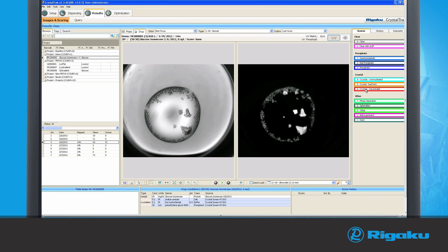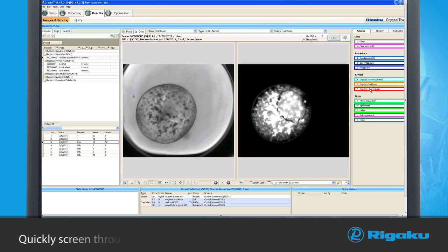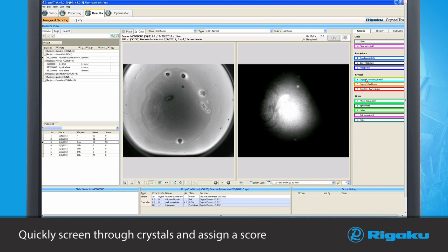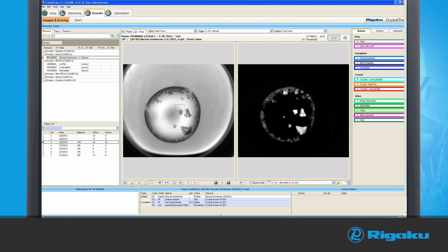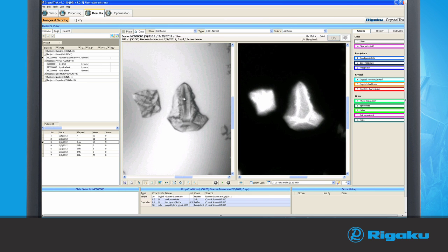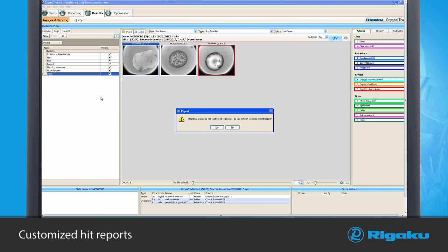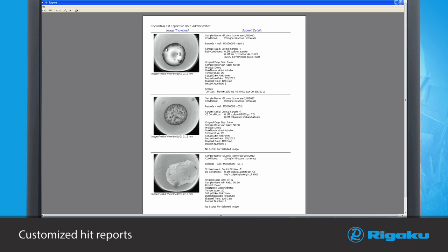With CrystalTrack's comparative image view, you can quickly screen through crystals and assign a score to each drop using the scoring board on the right side. The rubber band tool allows you to zoom around any region of interest and measure the size of any crystal. Customized hit reports are generated based on previously tagged crystals that list the crystallization conditions, protein samples, and date of setup.